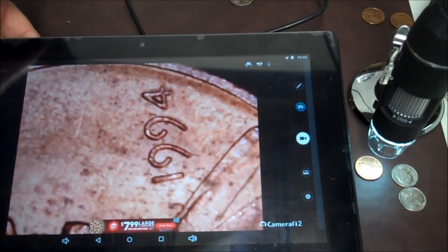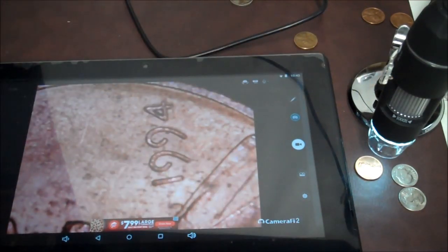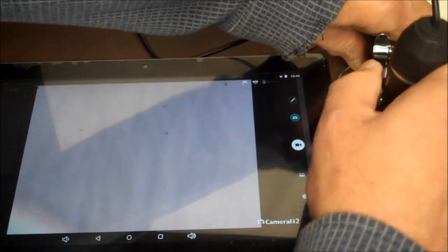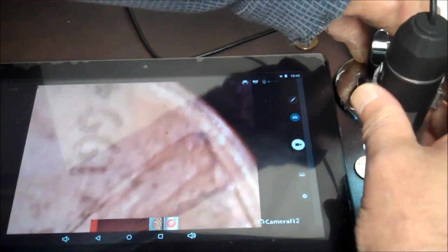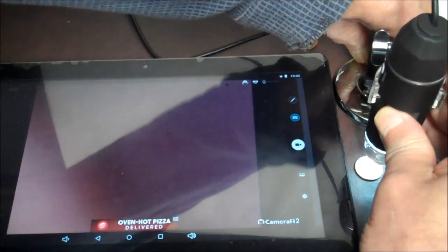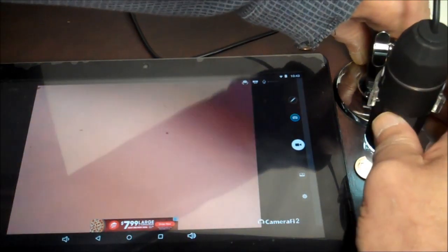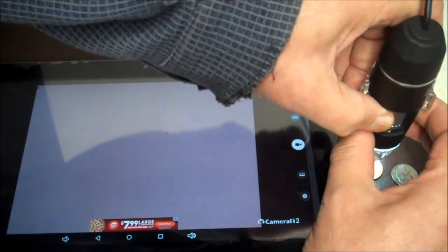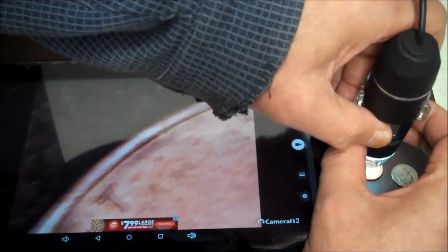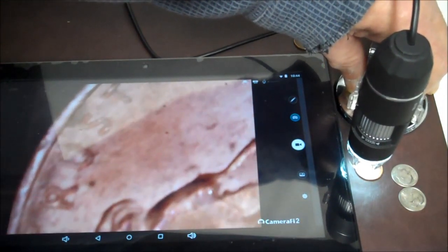But anyway, if you get real close, you move the knob all the way to the right and that'll focus even, that'll zoom even more. So what I'm going to do is move this down closer. Yeah, not working too good. Anyway, you can see it's nice and zoomed in.